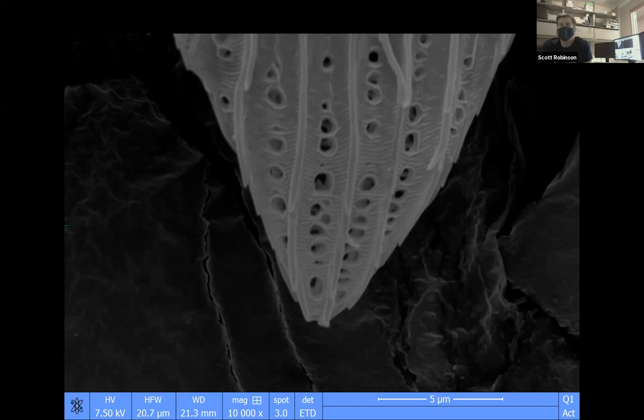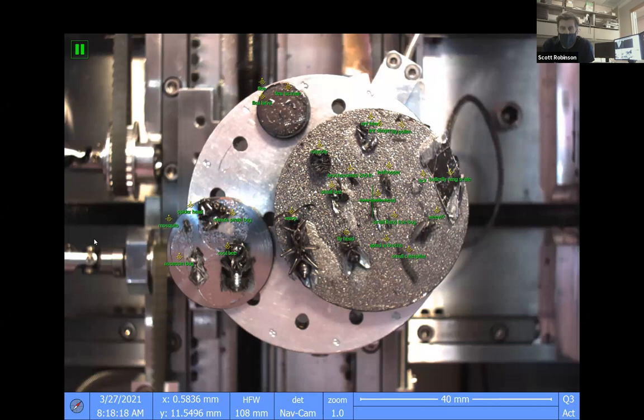We were able to create a website where people could then send us insects. We would mount the insects on a stub, just like the one that we've seen here, the metal stub, like this one on the right. So people will send us insects, or we will mount them. Insects are arthropods, because not everything we're looking at is exactly an insect with six legs.